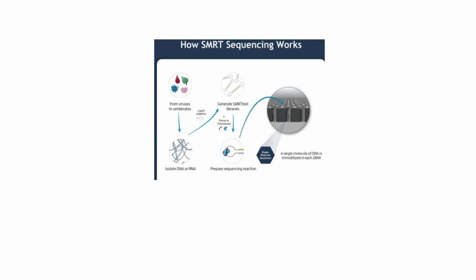genomic regions. After sequencing, sophisticated algorithms assemble the millions or billions of short and long reads into a complete genome by finding overlaps and piecing the fragments together, much like reconstructing a jigsaw puzzle.